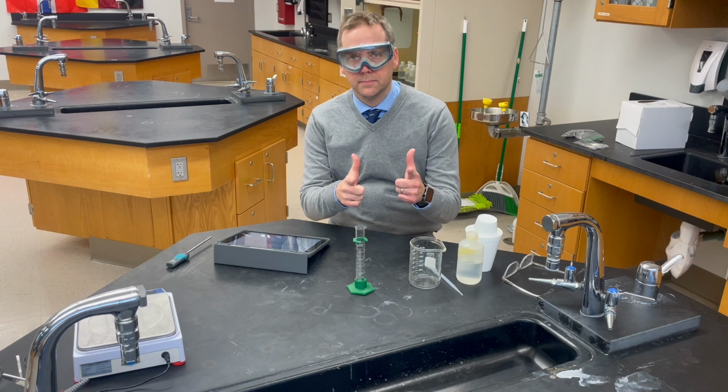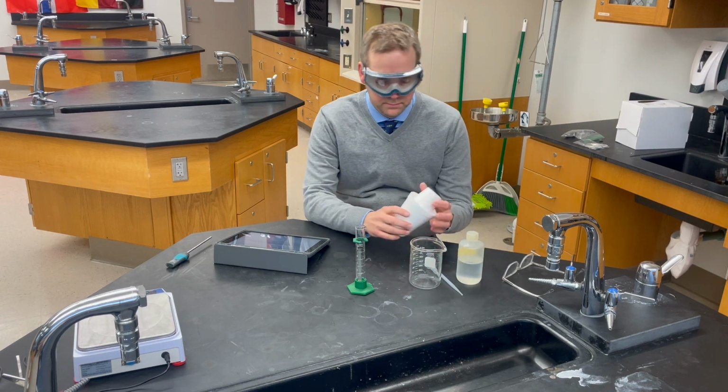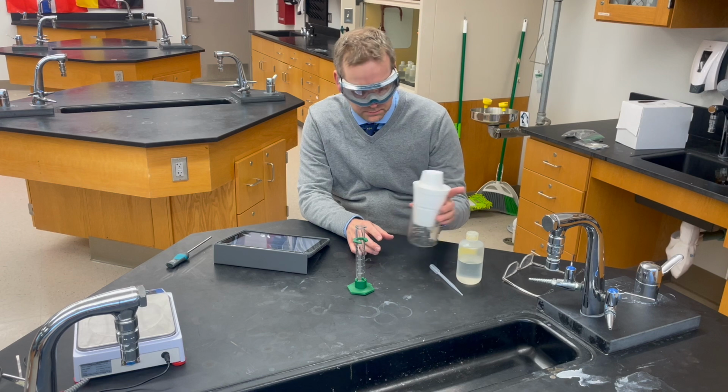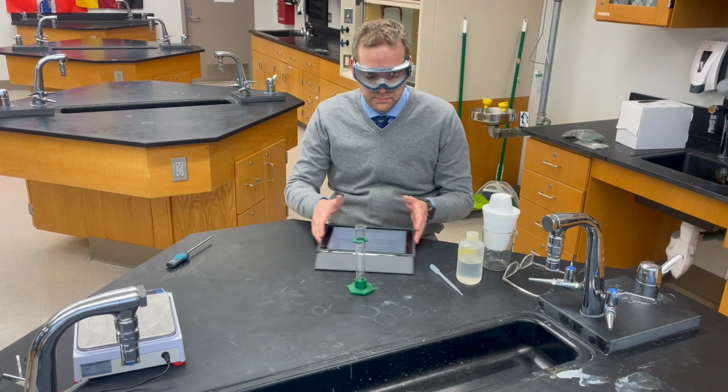Today we're going to do lab number 9. This is a heat of reaction lab. I've got my calorimeter here. I'm going to set it in this beaker so that it doesn't tip over, for stability.